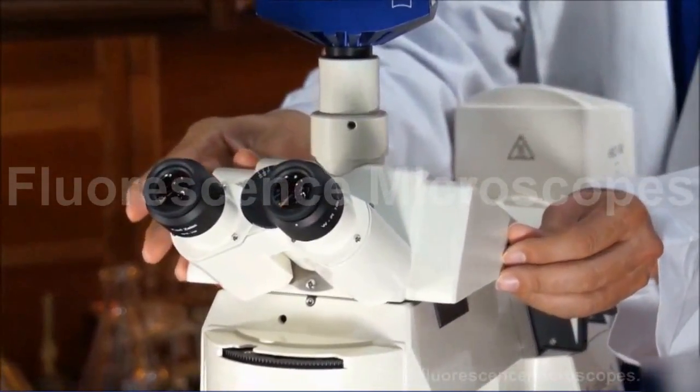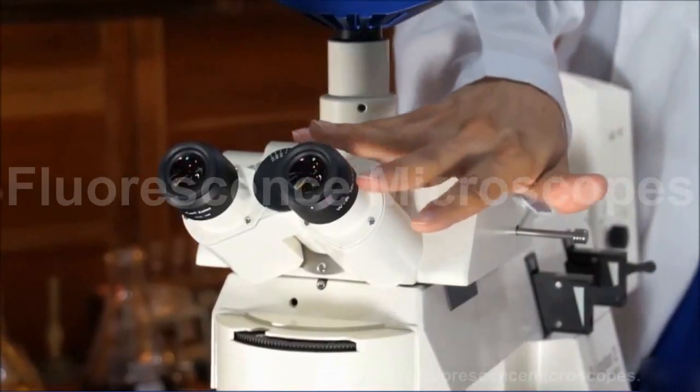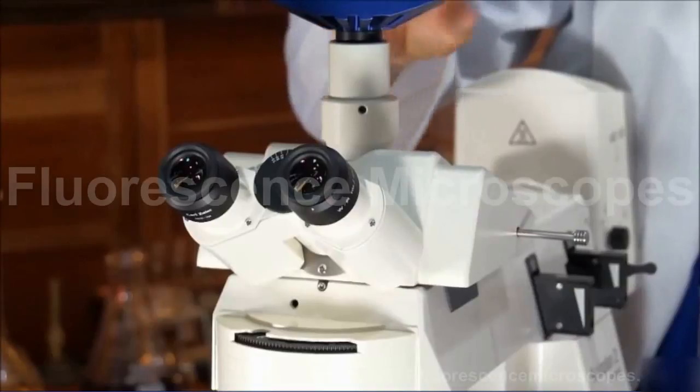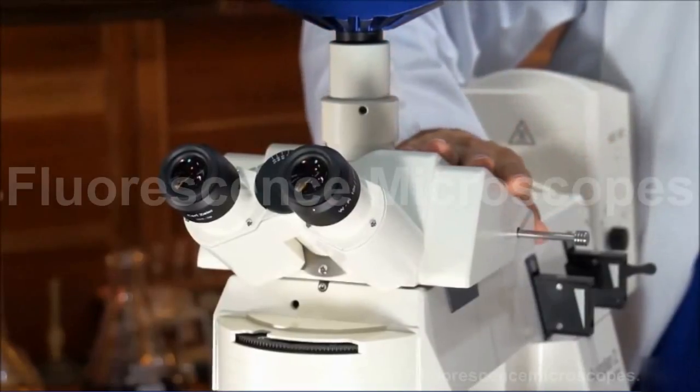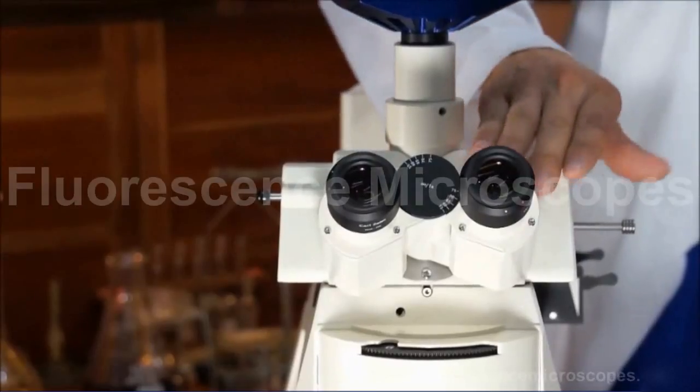This particular head is a three-position. You can get 100% of the light to the eyepieces, 100% to the camera port, or a split between the two: an 80-20 split, 80 to the camera, 20 to the eyepieces.